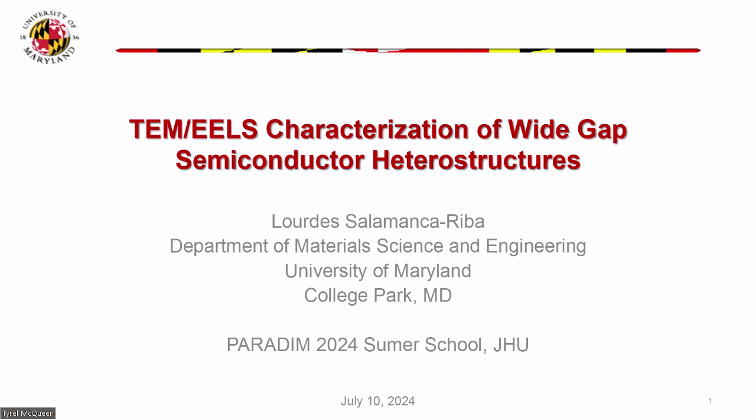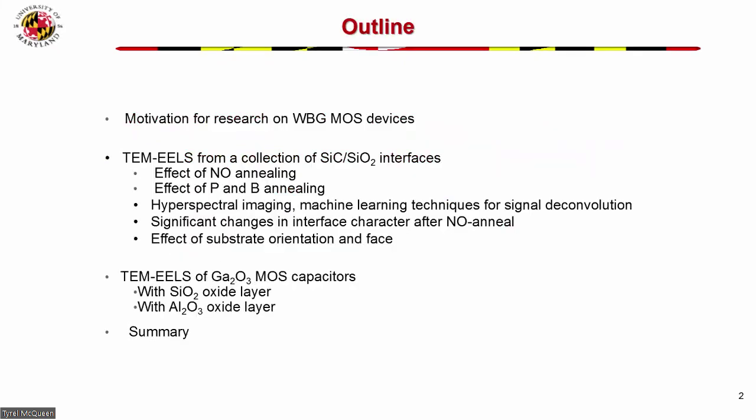So, please. Thank you. Can you guys hear me okay? Yeah? Okay, good. So first of all, thank you very much for the invitation to give a talk here at the summer school. It is nice to see so many people here. So I'm going to talk about transmission electron microscopy and electron energy loss spectroscopy for the characterization of wide bandgap semiconductor heterostructures. And again, I'm at the University of Maryland in College Park.